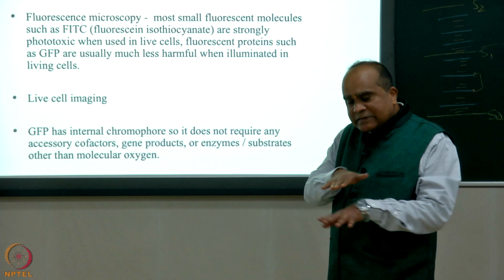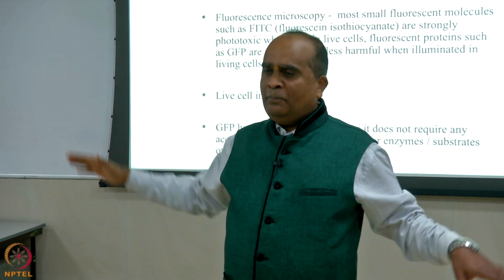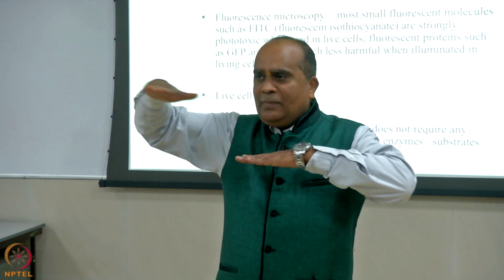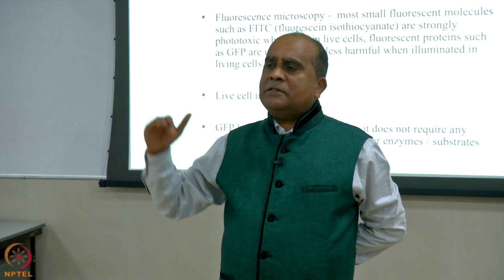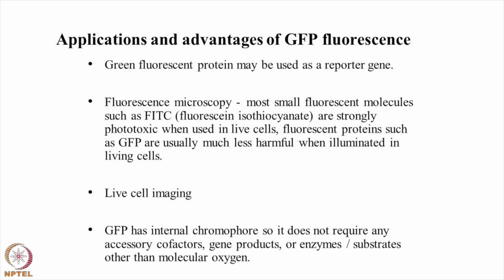So, live cell imaging, time lapse, in the next microscopic facility, a beautiful setup that we have, you can really look at the slice wise cell, right? Live cell imaging, how things are happening inside the cell, and GFP internal chromophore does not require accessory cofactor, gene product or whatever, you can do it.